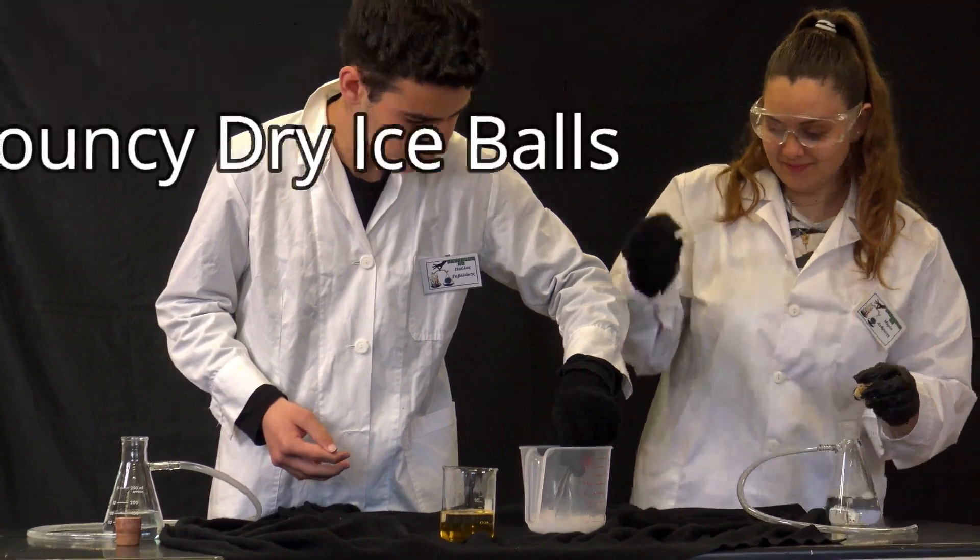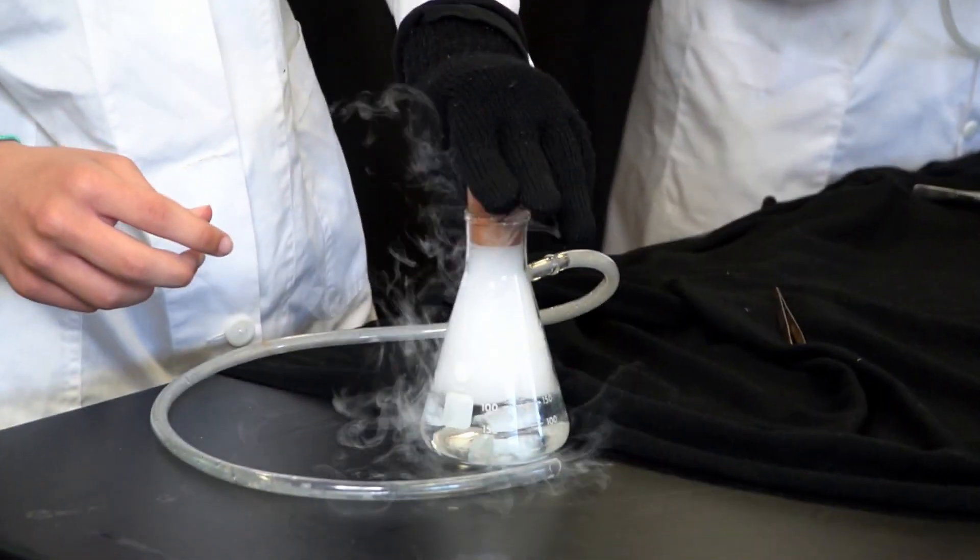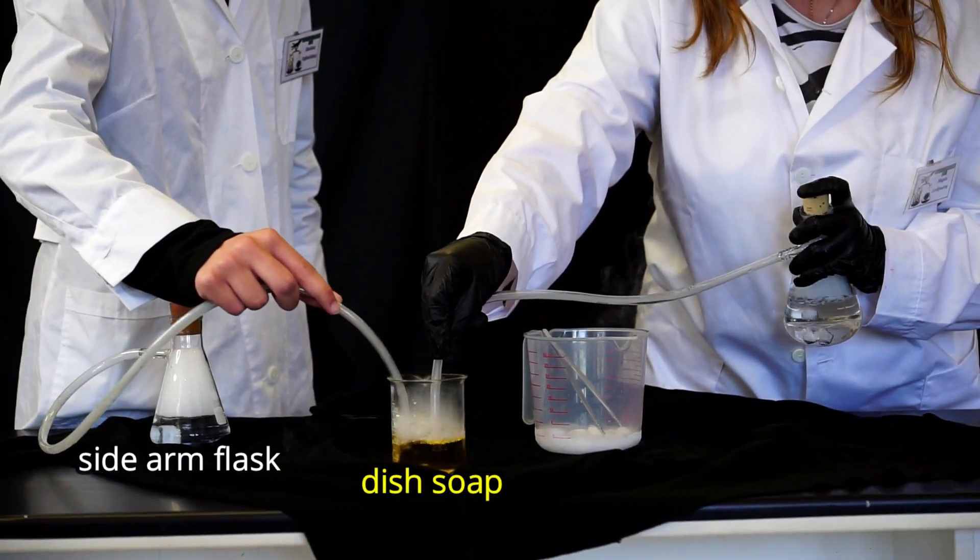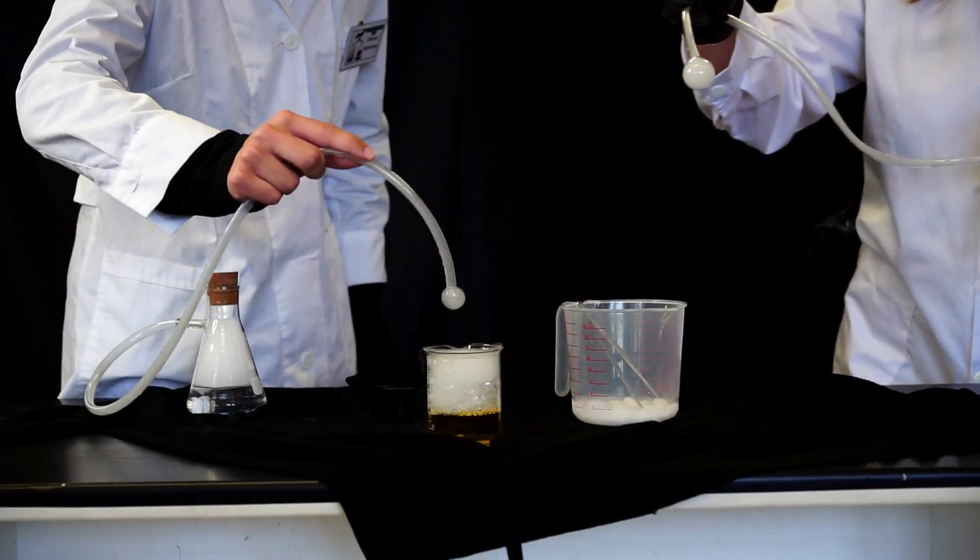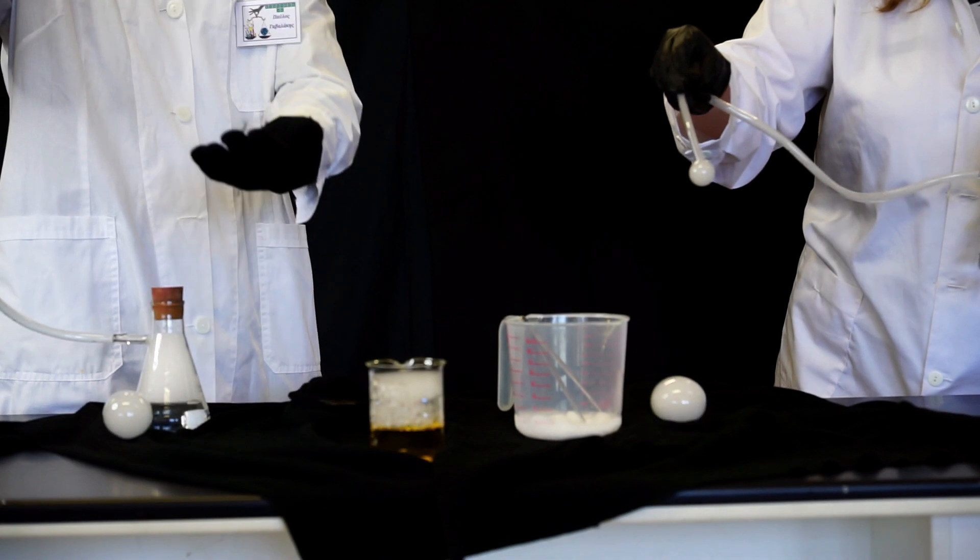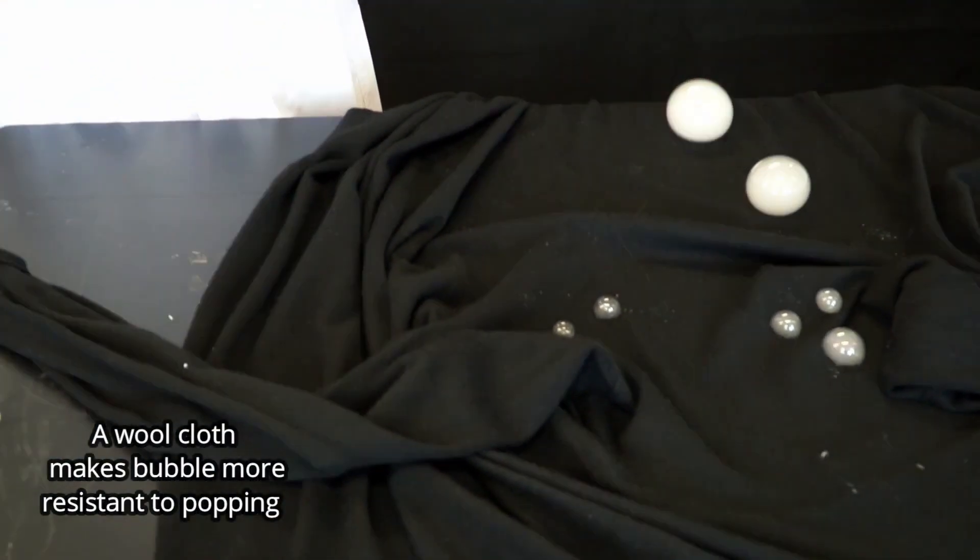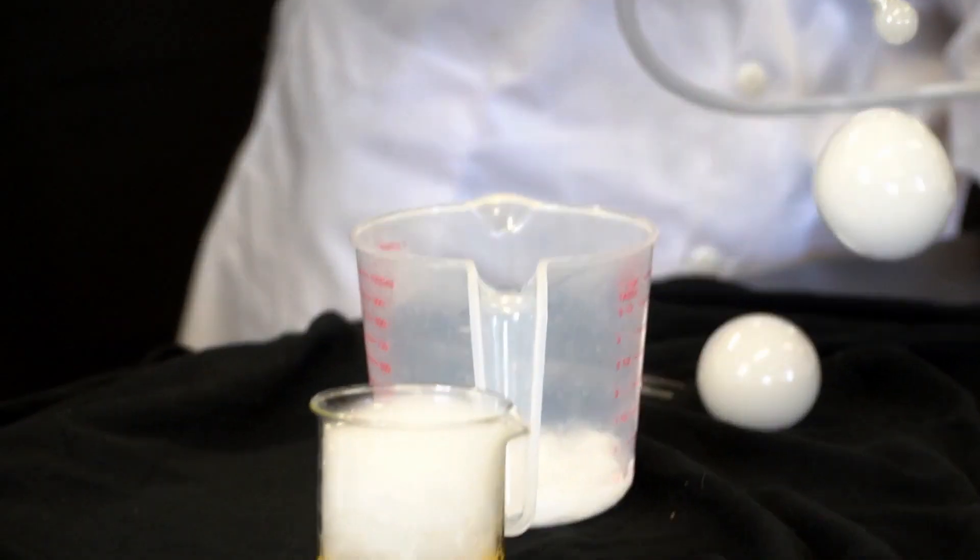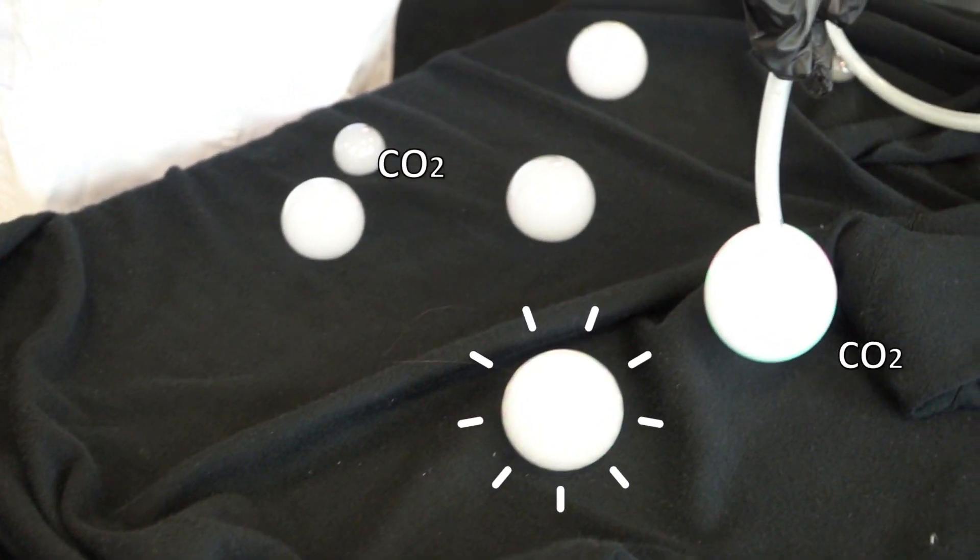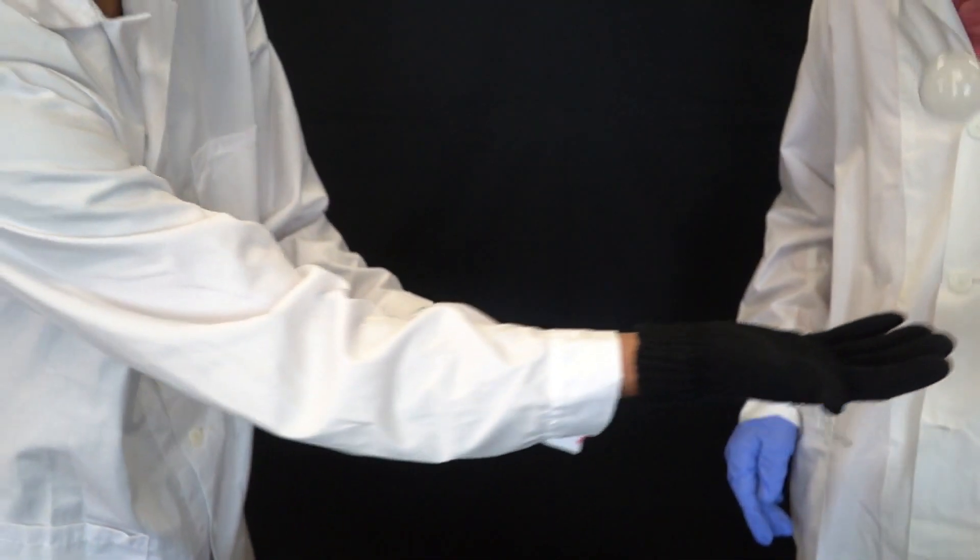In this experiment a piece of dry ice sublimes to CO2 gas which is conveyed to a kitchen soap solution. The higher pressure inside the flask forces the formation of a dry ice bubble. These bubbles are very bouncy cause they are more stable compared to typical soap ones. Moreover CO2 partially diffuses across the bubble soap film and therefore the bubble gradually decreases in size.